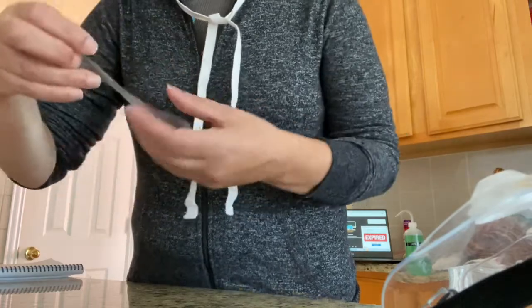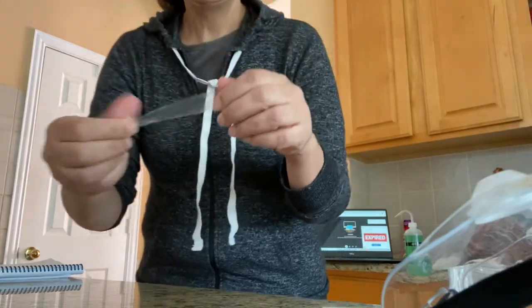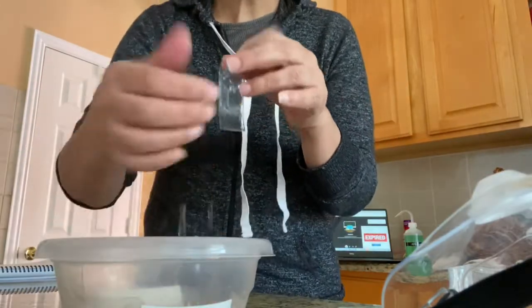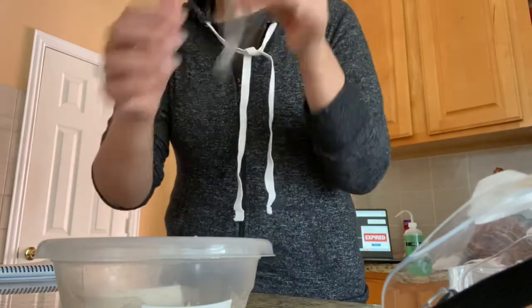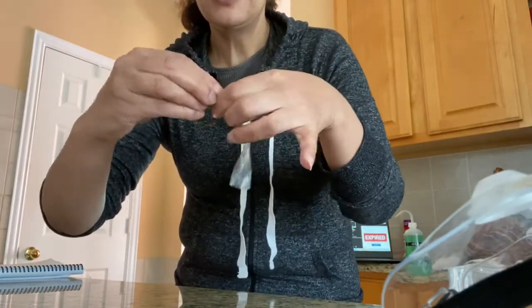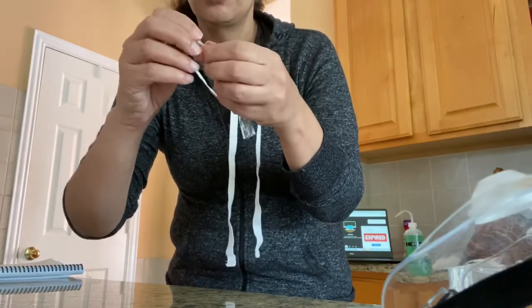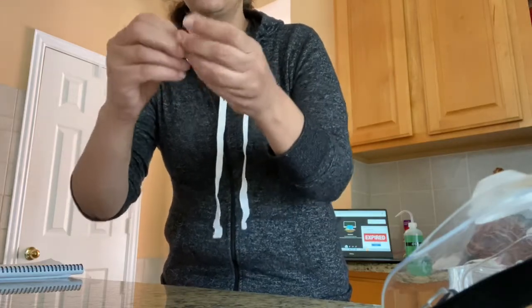So first I will take my dialysis tubing, right, and a beaker with some water. It's helping me to open it, because if you see, we can open it. So I open it on one side, and then I go to this side, and I am going to do it this way and take a little rubber band, and I am going to close it. Tie it very well to not have any leaking, just on one side.